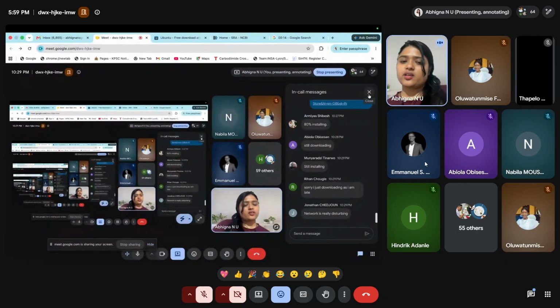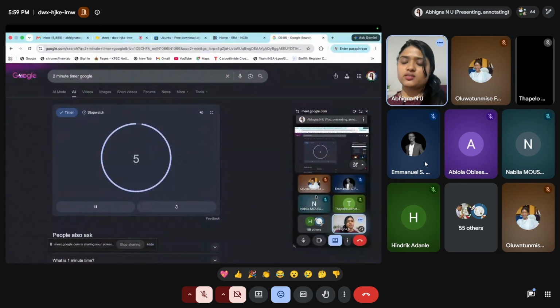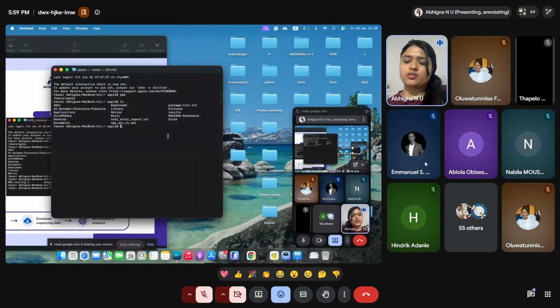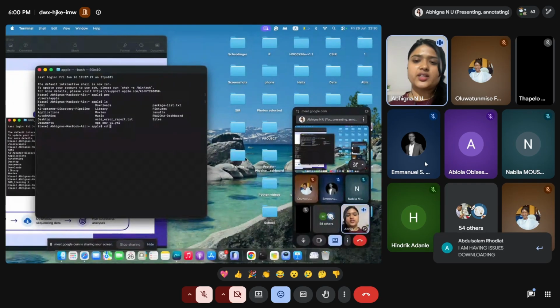So just take a look at what I am doing now. We'll practice it on my MacBook, and I have my training materials in the folder called training.